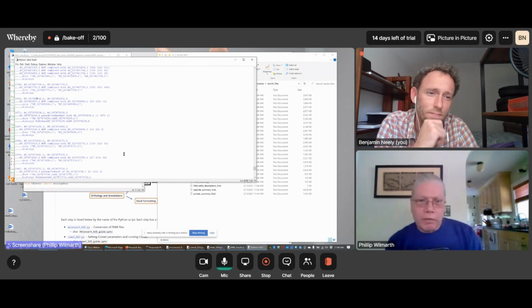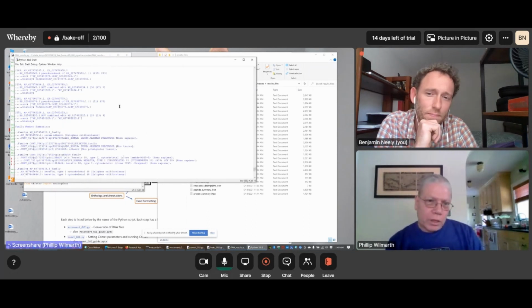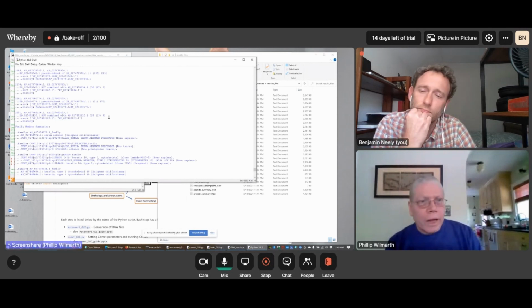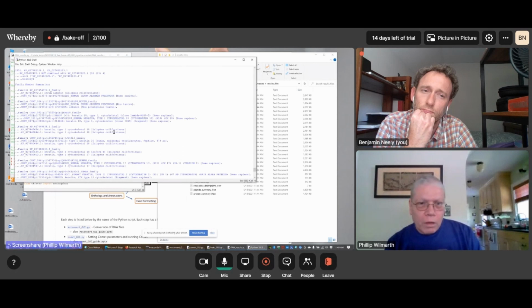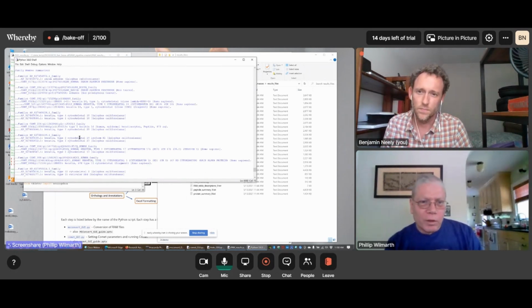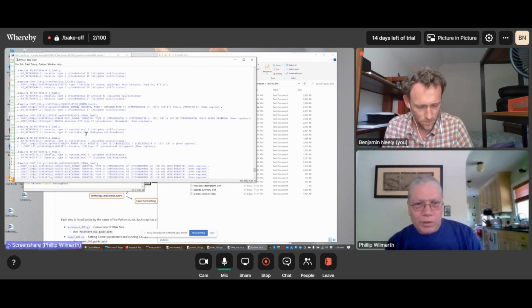So this thing goes through and does that. And this stabilizes quantitative data, because usually the shared peptides are problematic in quantitative work. If you don't lump those proteins together, then you've only got a handful of unique peptides that you can base the quant on, instead of using the entire set of peptides from those families, and you can get some really erratic results. But if you look at the accessions, the protein descriptions that get lumped together, they make sense. They're almost always protein families or things that are isoforms of one another.